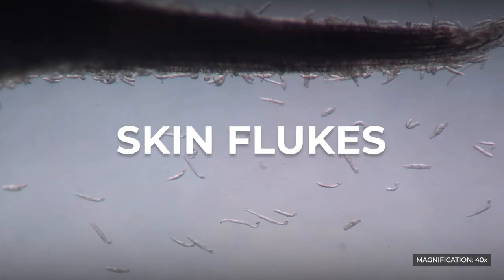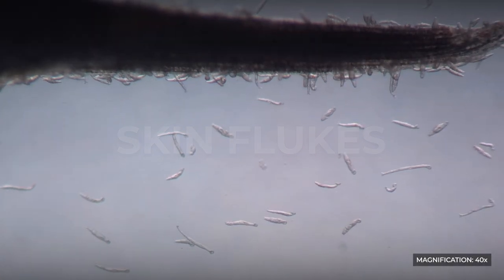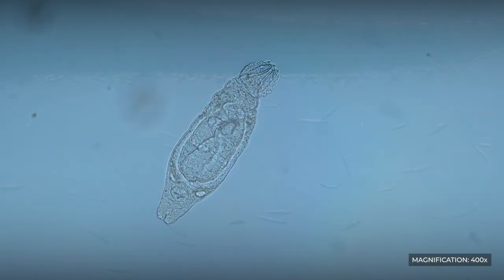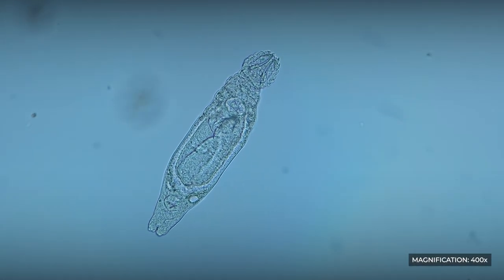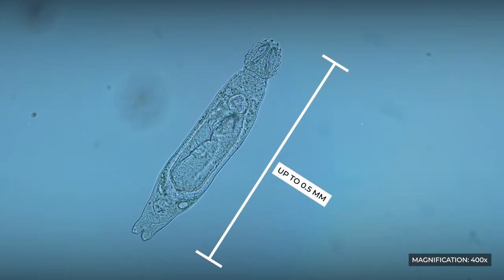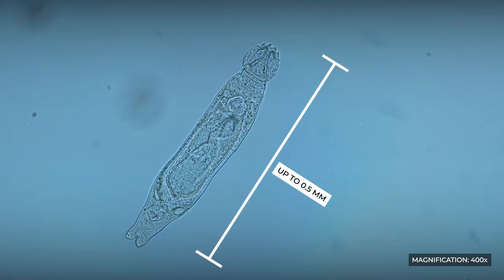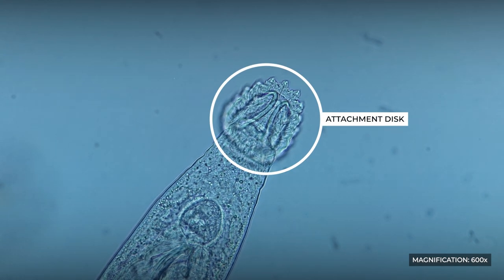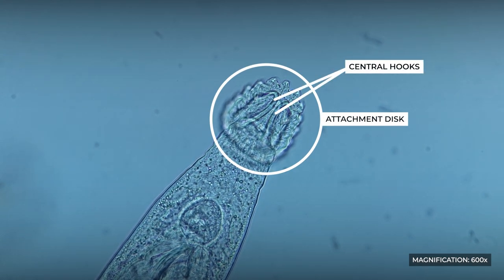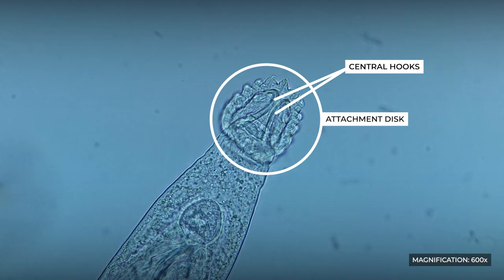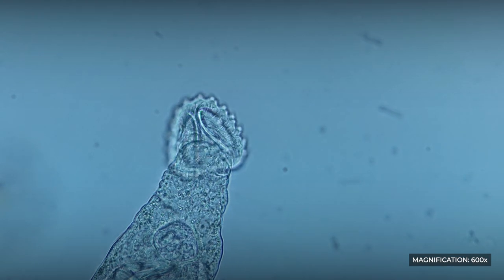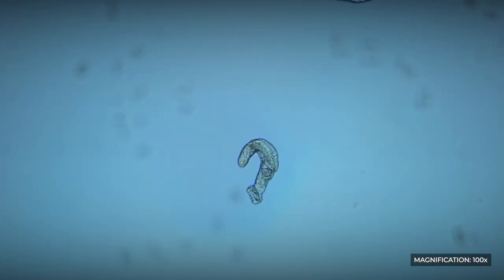Skin flukes: The genus Gyrodactylus, or skin flukes, has over 500 species. The worm's body is elongated, flattened, and up to half a millimeter long. At the posterior end there is an attachment disc equipped with two large central hooks and several smaller hooks arranged in a circular pattern around the disc. The anterior end of the body usually has two lobes.